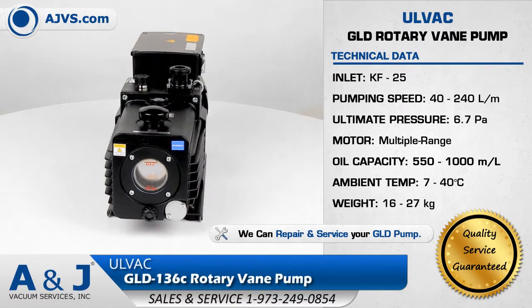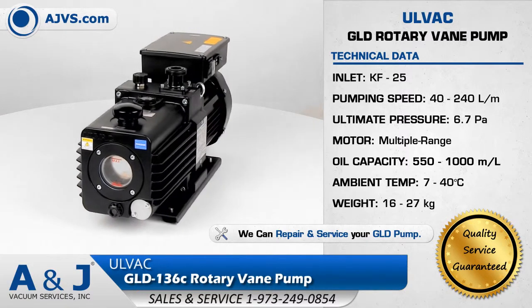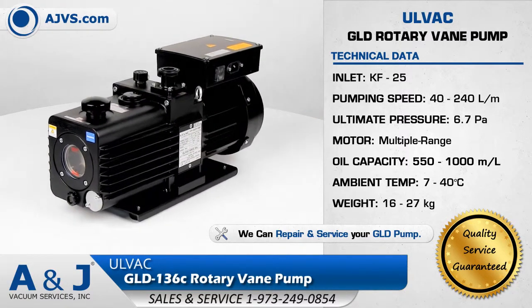The Olvac GLD features an oil backflow prevention mechanism, gas ballast valve, and large-size oil level gauge.